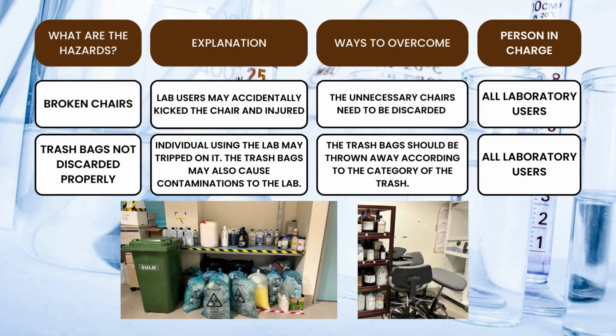The first hazard found was the broken chairs. This could cause accidents and injury to the lab users. To avoid that, the broken chairs should be discarded and all laboratory users should be involved.